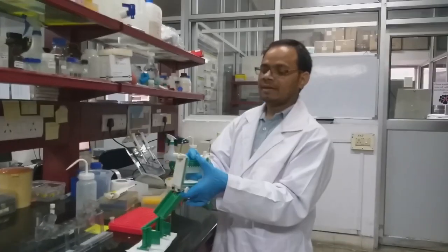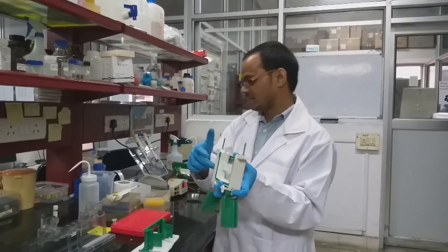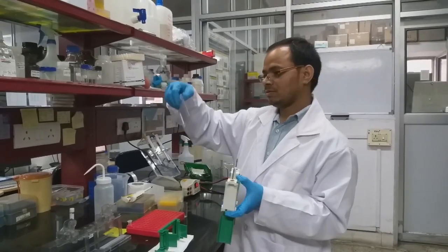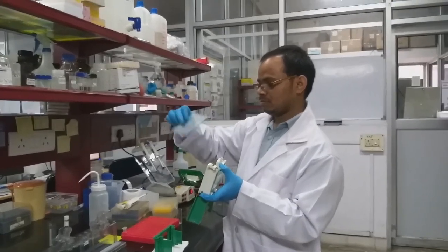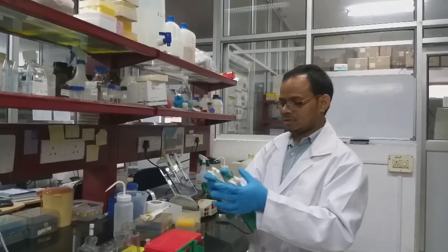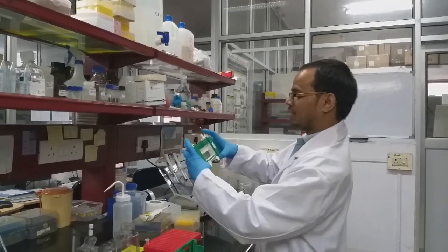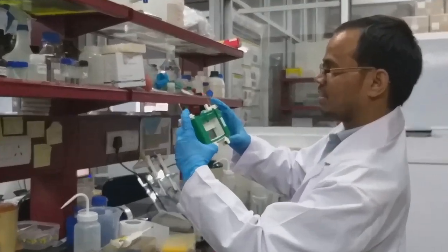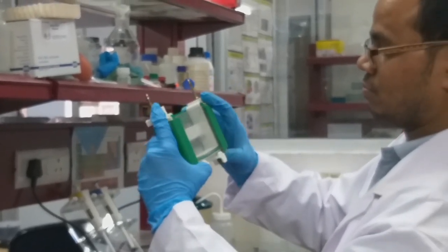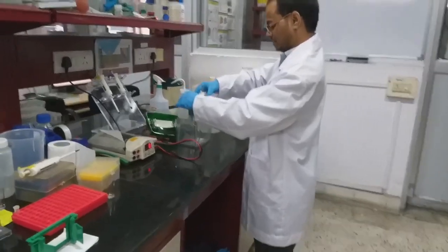Inside this tank, we only have this one side. You have to cover the other side also. For that, we use a dummy plate. Just hold it tight and close this. After that, gradually adjust the gel length. So we just have to fix it like this.